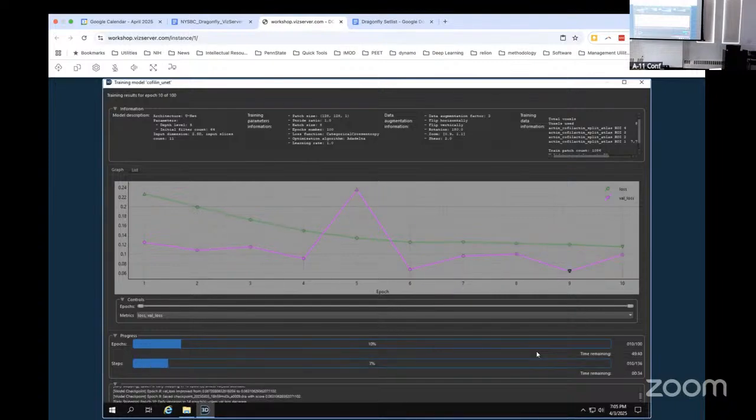Yeah, the real data. Okay, so if you just double click on it. Okay, cool, too many data sets. So then I train on it? This is doing it on the right slice. It doesn't matter if you select. Yeah, just in the deeper one, that's where you select.